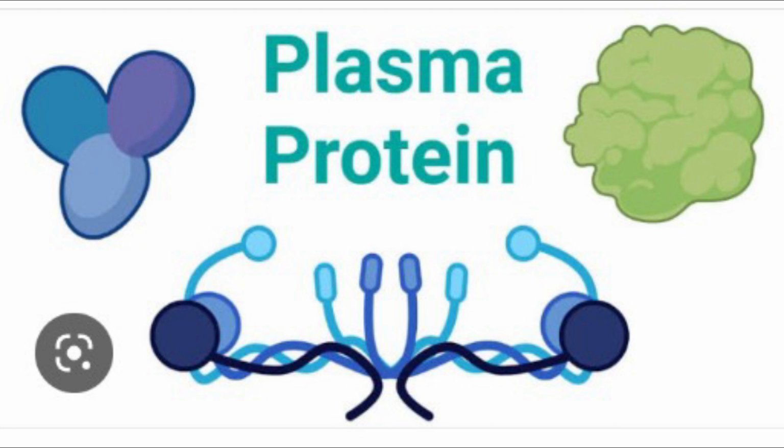Molisch test. Albumin is known to be a glycoprotein containing carbohydrate and protein portions. As this test is specific for carbohydrate, the sulfuric acid dehydrates carbohydrates to give furfural derivatives which condense with alpha naphthol to give a colored compound. Procedure: albumin solution 1 ml, 2 drops of alpha naphthol, mix and add concentrated sulfuric acid from the side of the tube and observe the reddish violet ring at the junction of two layers.